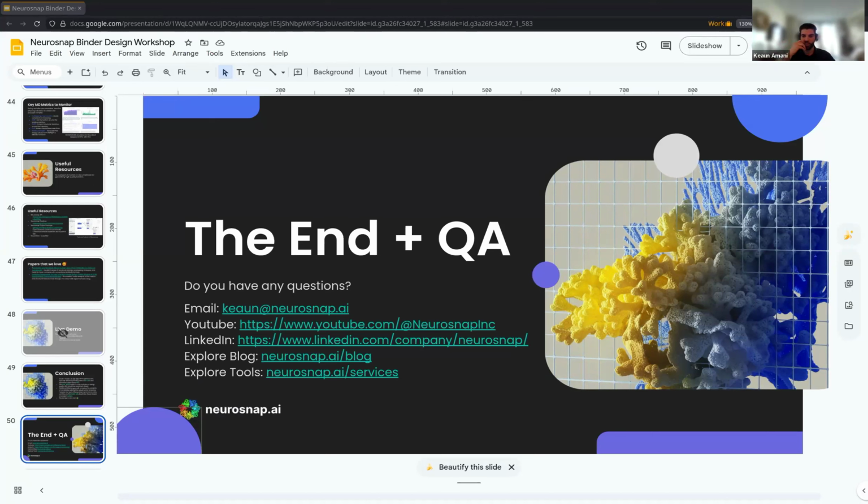For instance, we developed these nanobodies for another collaboration with a different organization, and we used NeuroBind to generate these nanobodies, and we saw the expression for that one to be about 96%, if I recall correctly, and the solubility was definitely quite good too. The binding affinity was definitely the bottleneck for that one, and out of 46 different candidates, the first time we got absolutely nothing that actually bound.